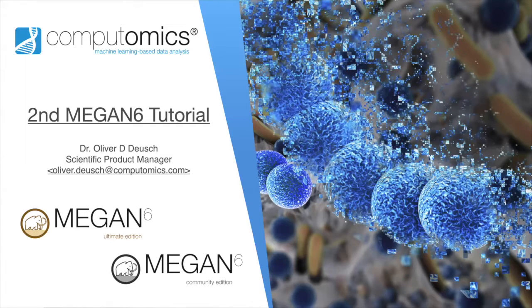In this tutorial, Oliver will give a quick overview of the recent updates to MEGAN6 Ultimate Edition. Then he'll dive into a live demonstration showing data visualization and how to automate workflows with MEGAN scripts.